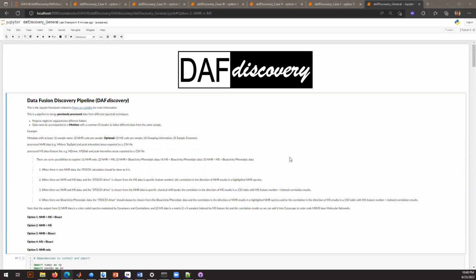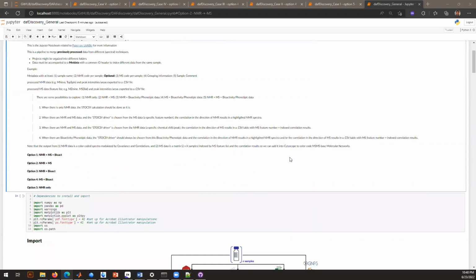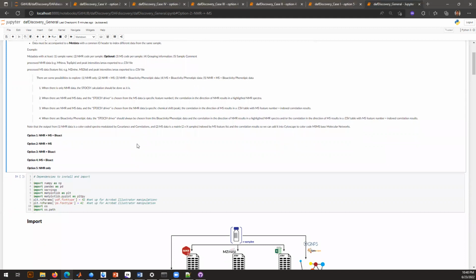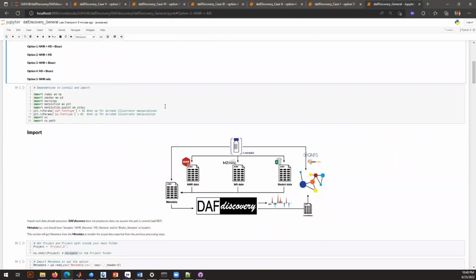So this is the interface. It's a Jupyter notebook. It's all written in Jupyter notebook, so it's really easy for others to follow. So let's go. This is just information for cells. This information is marked as markdown text, and these little clear yellow background cells are marked as code. You can see the code here, and these would be markdown.